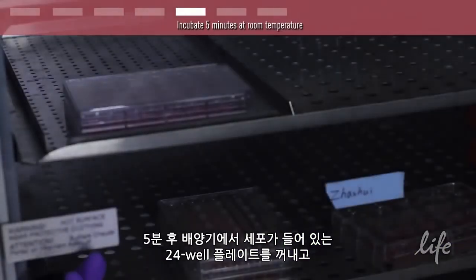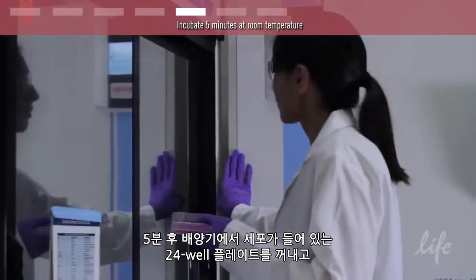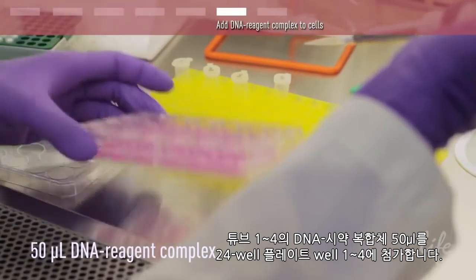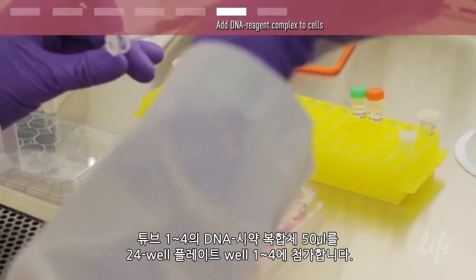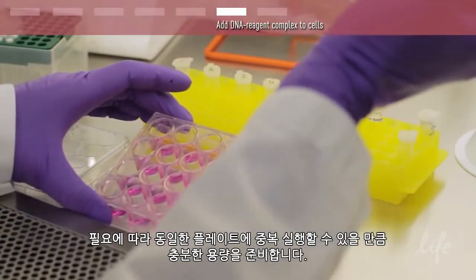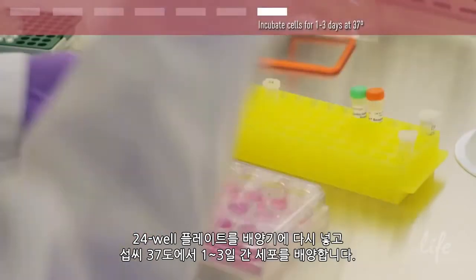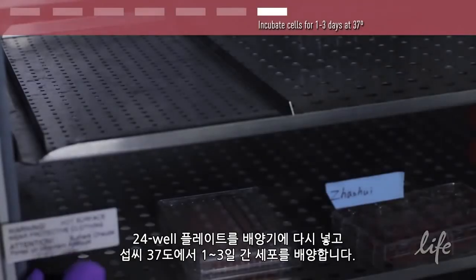After the 5-minute incubation, remove your 24-well plate containing your cells from the incubator and bring it to the workspace in the hood. Add 50 microliters of the DNA reagent complex from tubes 1 to 4 to wells 1 to 4 of the 24-well plate respectively. You should have enough volume to run duplicates on the same plate if desired. Place your 24-well plate back into the incubator and grow cells for 1 to 3 days at 37 degrees Celsius.